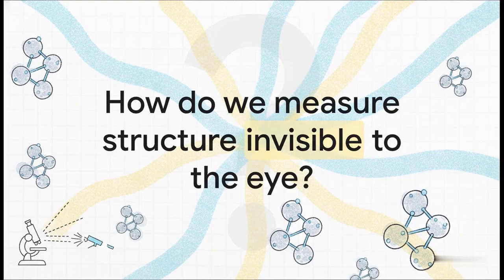But let's pause for a second. How do we actually measure the physical structure of something completely invisible to the human eye? I mean, when a particle is measured in nanometers, literally a billionth of a meter, you can't just toss it under a standard microscope and call it a day. We need a proxy. We need something with a wavelength tiny enough to interact with the actual atomic lattice of the material itself. And right there, that's exactly where X-rays enter the chat.